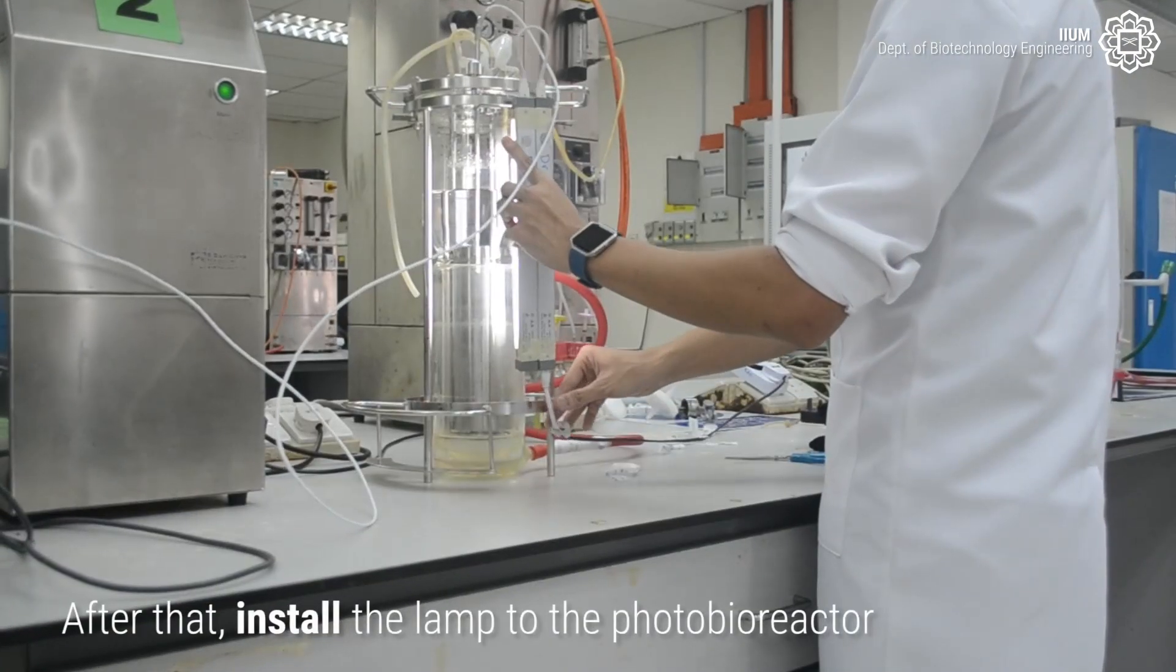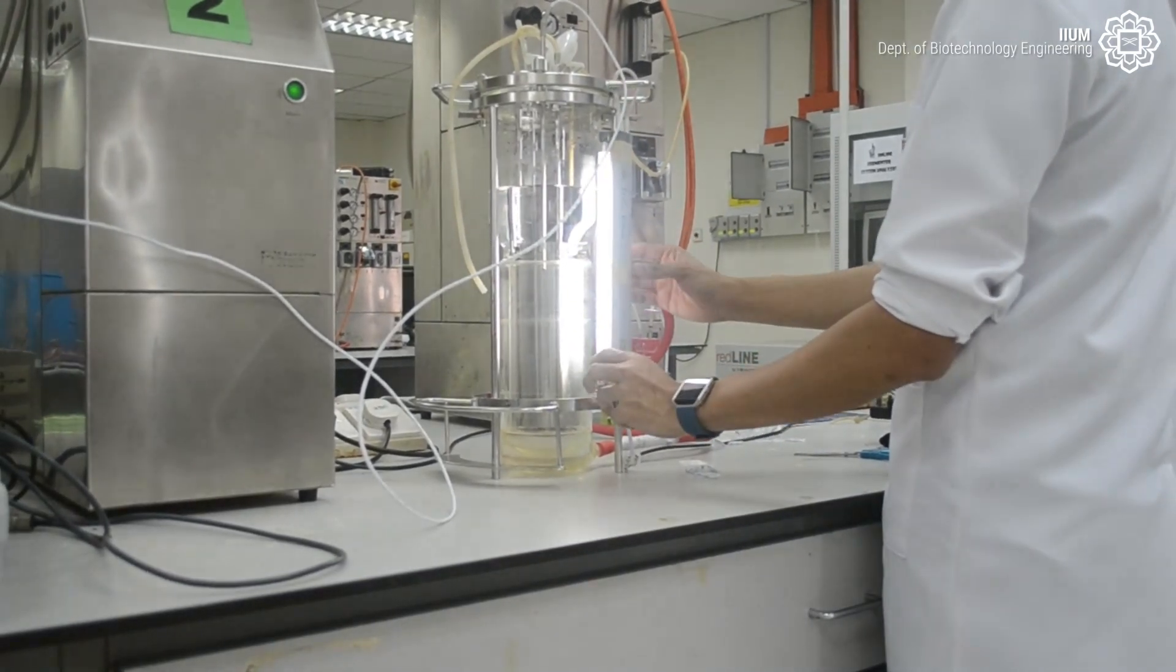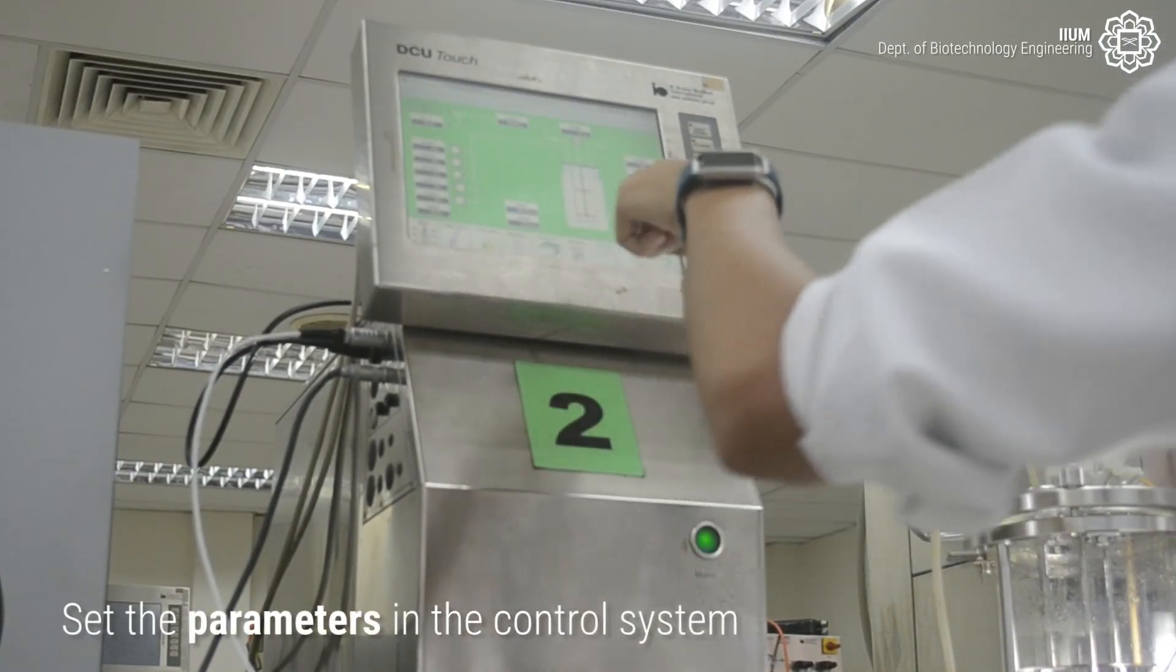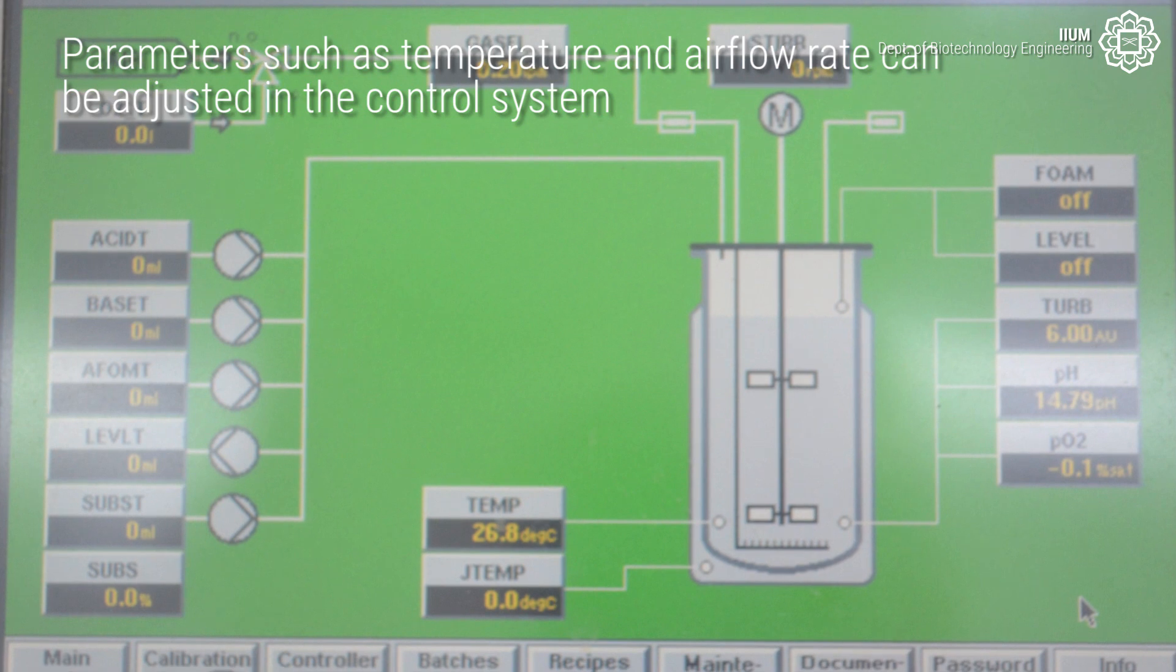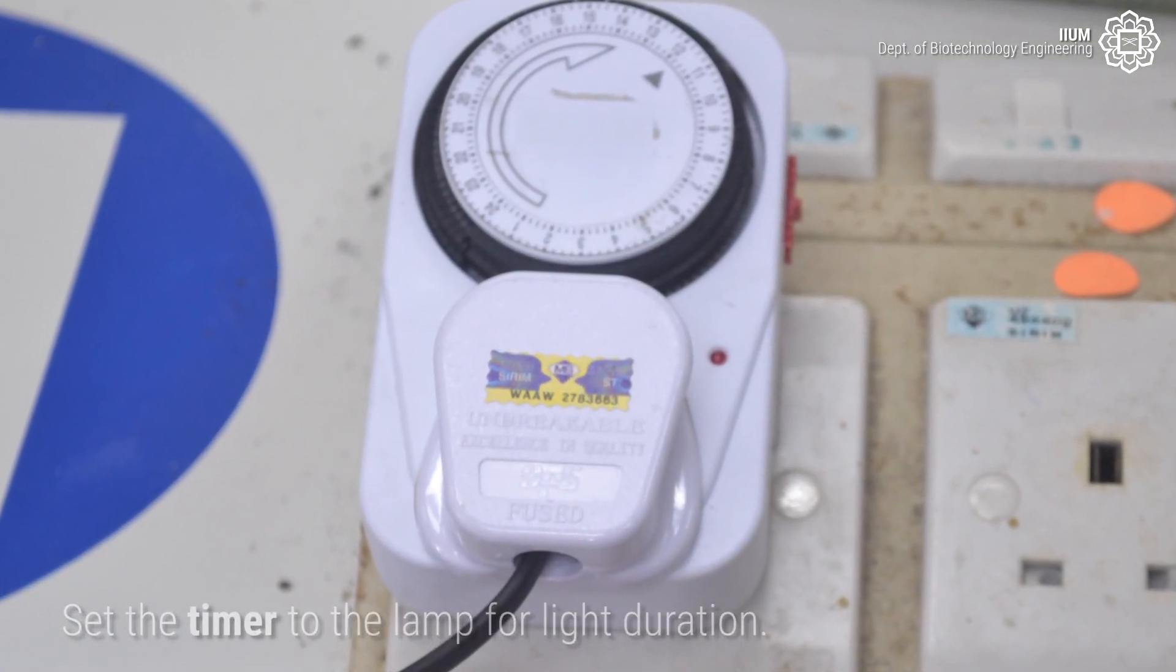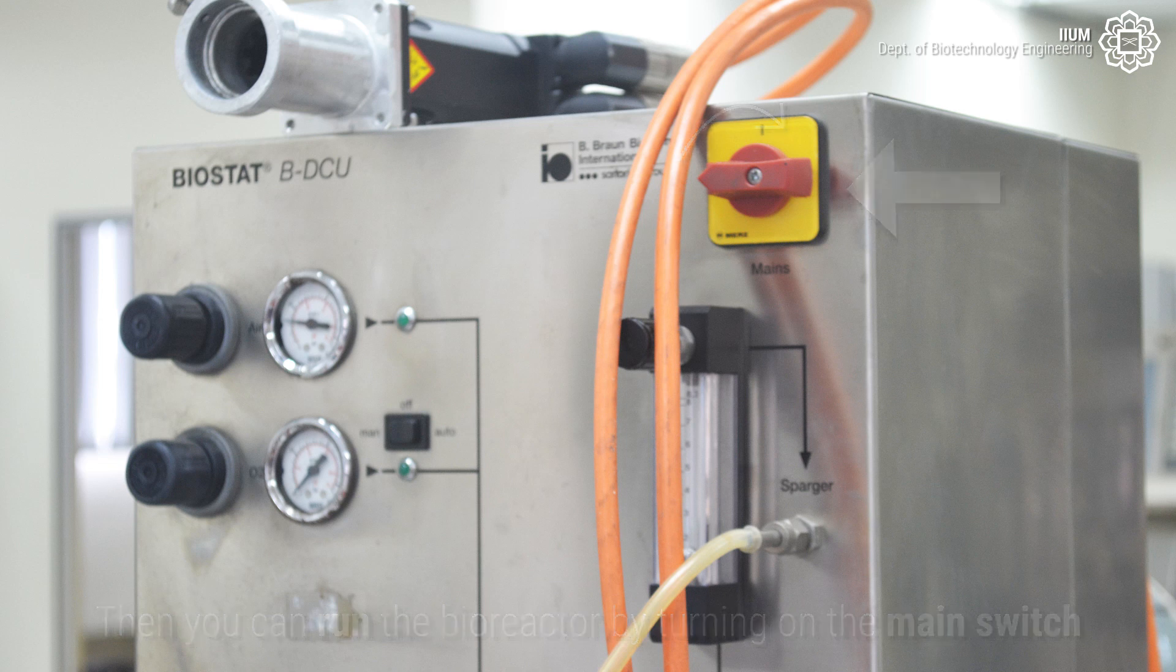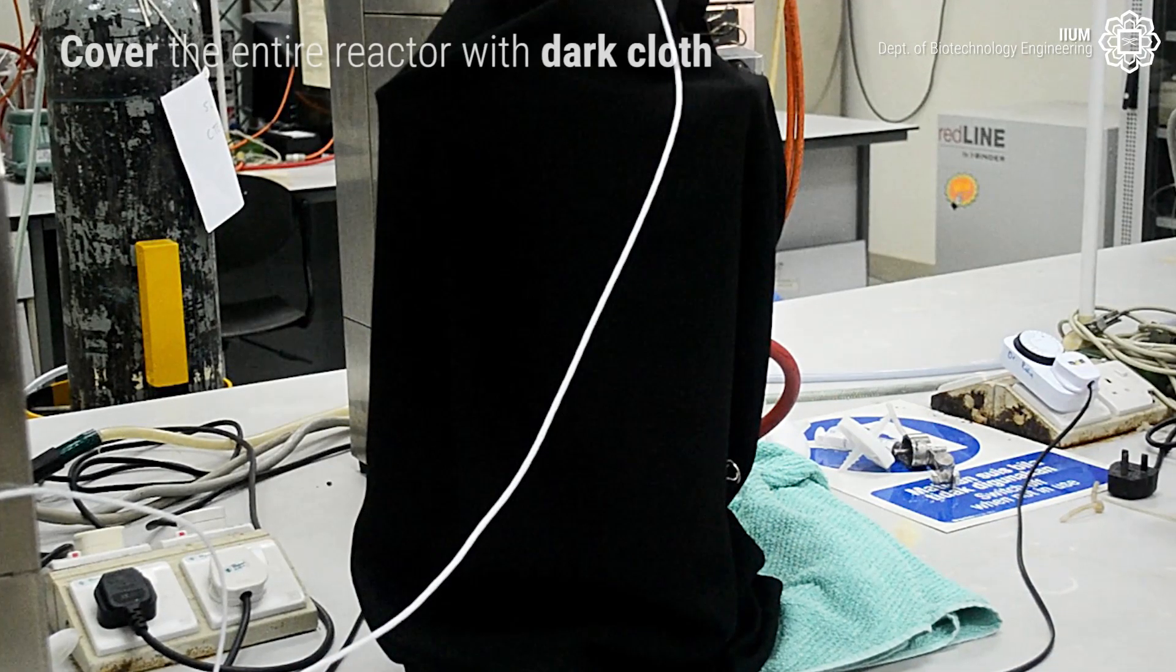After that, install the lamp to the photobioreactor. Set the parameters in the control system. Set the timer to the lamp for light duration. Then you can run the bioreactor by turning on the main switch. Cover the entire reactor with dark cloth.